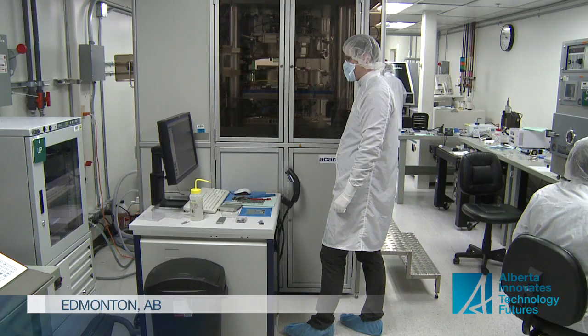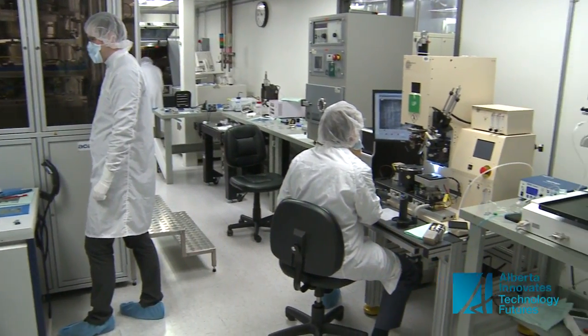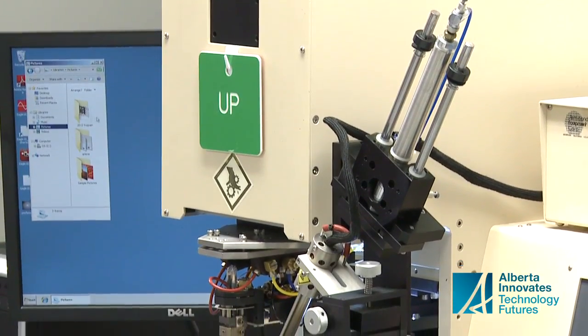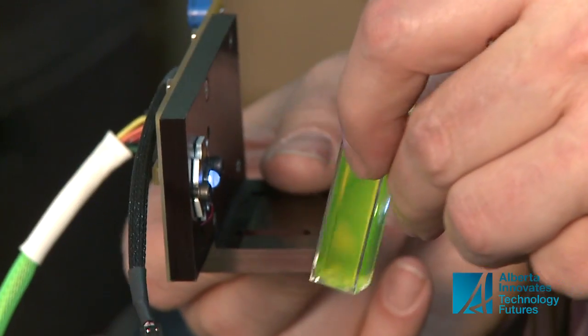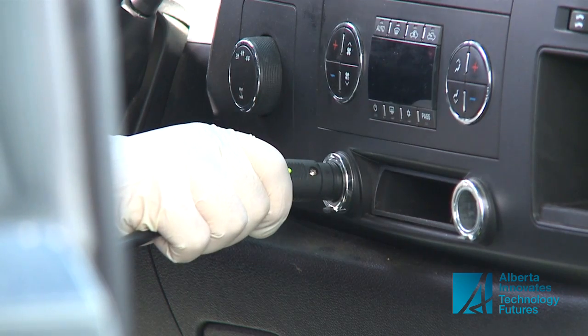That's when Schmidt turned to ACAMP, the Alberta Centre for Advanced Micro Nanotechnology Products. It's a not-for-profit organization that helps companies build a business plan and manufacture their product. We have a team of engineers to review the product from simulation all the way through final assembly. ACAMP helped design and build the strong ultraviolet light needed for the quat box. This allowed us to have a very bright light to give us very good sensitivity, and also to have a very stable light.